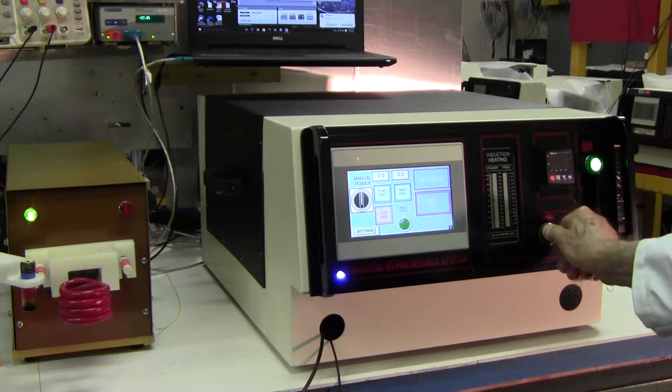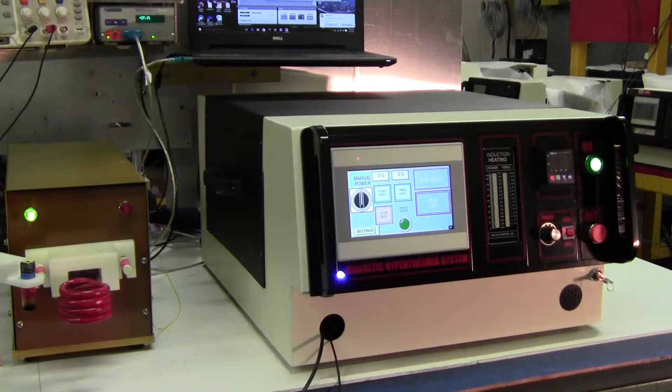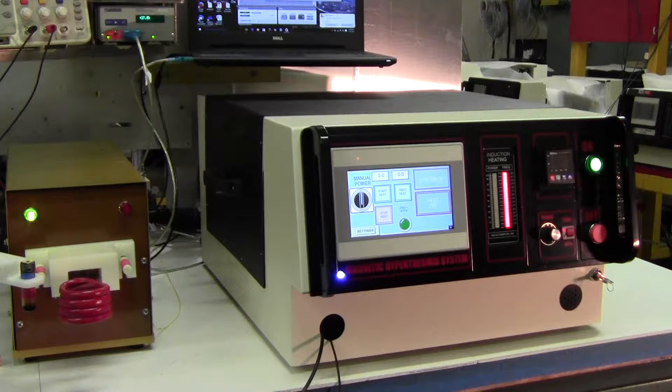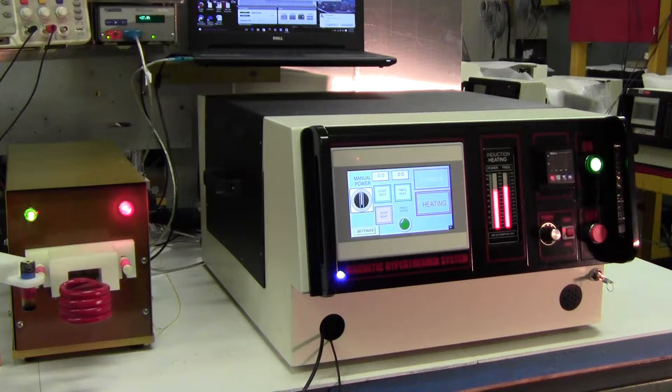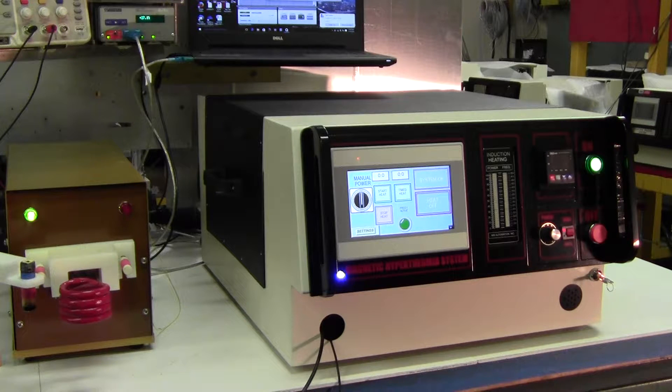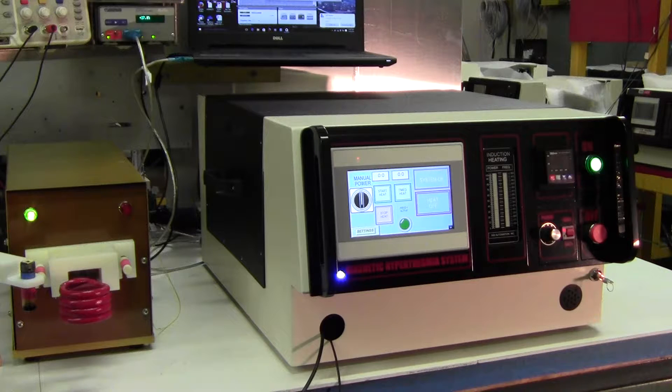Now I'll turn the power full power. I stepped on the foot switch again and we go to full power. Now that's manual control. As you can see, the machine operates at the power level that you set with the control knob.